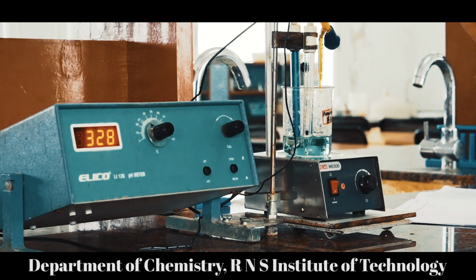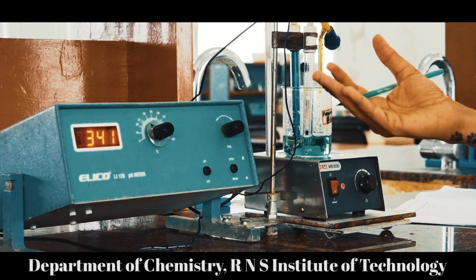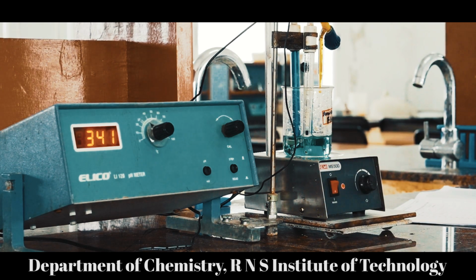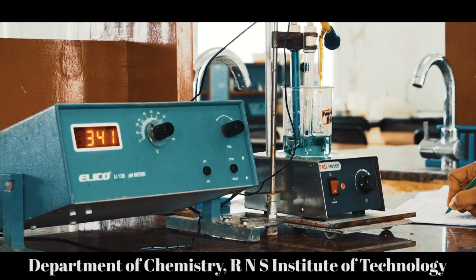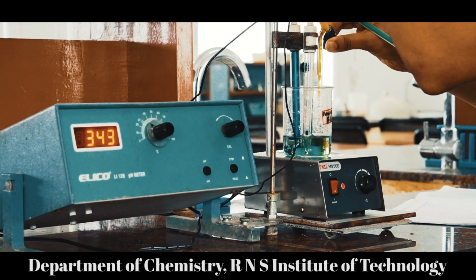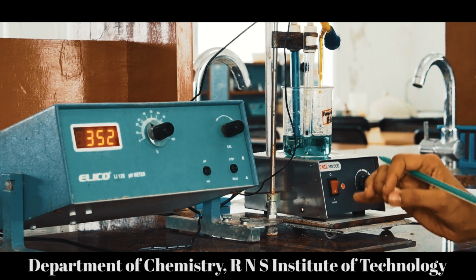You observe that the potential value increases because the Fe2+ ions in the beaker are getting oxidized to Fe3+ form, and the platinum electrode will measure the change in the potential for Fe3+ ions to Fe2+ ions. And also you will observe that in the beaker the solution color is changing. It is turning into greenish blue color. Here the green color is because of chromium +3 ions, and the blue color formation is because of Fe3+ ions.